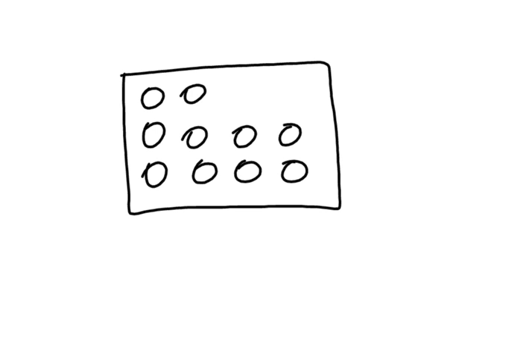So your basic materials. This is what we call a microscale lab. You're going to have a 12-well plate. Obviously yours is going to look a lot better than mine, but still, you'll have a 12-well plate, and you're going to use this 12-well plate to predict the result of potential chemical reactions based on the solubility rules, and then explain those reactions that do occur by giving me a balanced chemical equation. So, what you'll pretty much do is you're going to have solutions A and solutions B.